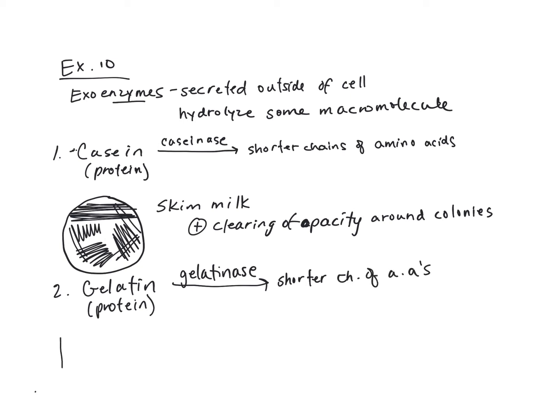Okay, so this is the only test that we're inoculating today in a test tube. That gelatin is, your book calls it semi-solid. You can turn the test tube upside down. It certainly looks solid, but it's fairly soft. So when you inoculate, you're just going to stab your loop down in and then come straight back up again. And then what we're looking for as a positive result, after we incubate that for a day or so, is the liquefaction of that gelatin.